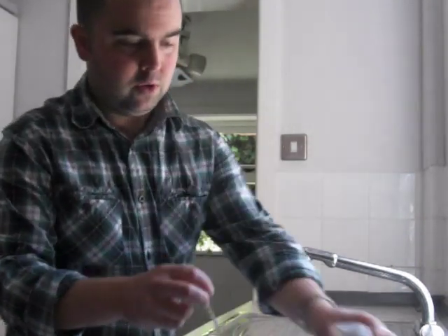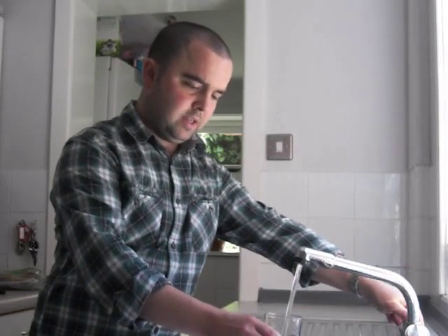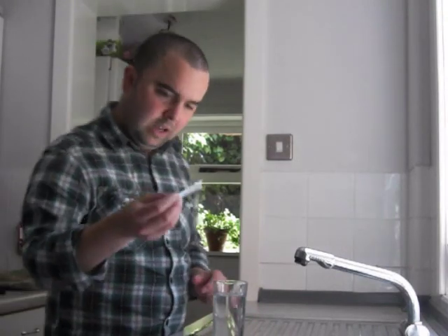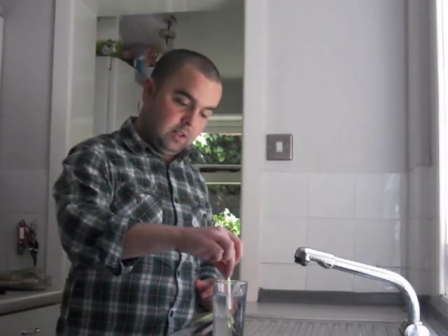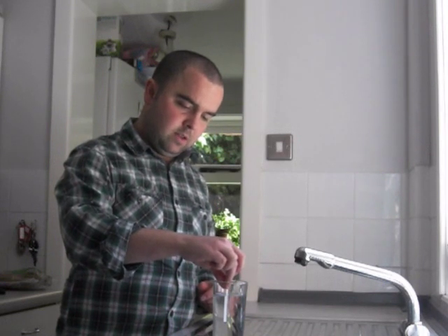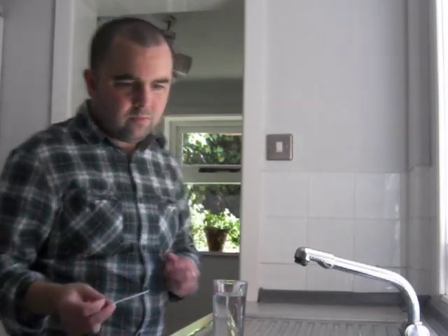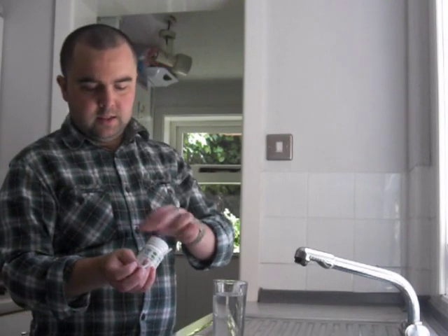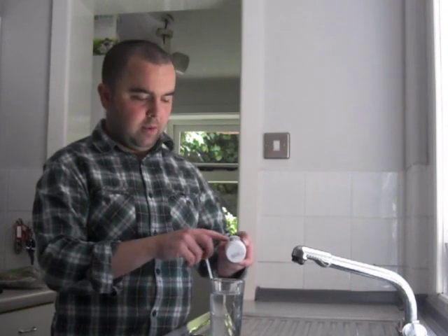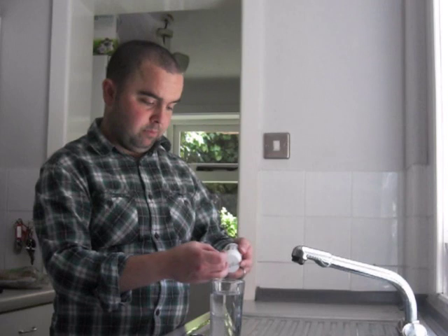All you do is take a strip out, take a sample of the water that you want to test, and then dip the strip into the water for about five seconds. Take it out, shake it, and then all we're going to do is compare the colour change on the strip with the different colours on the side of the bottle here.